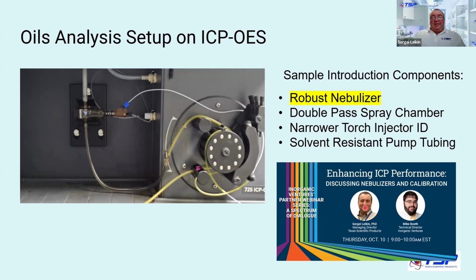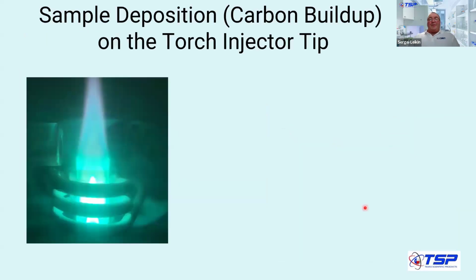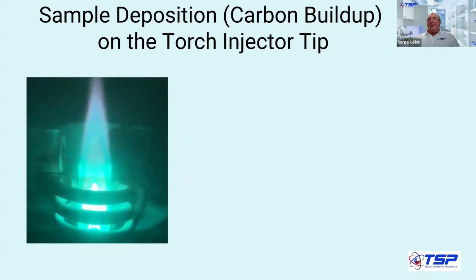So when you get this set up and then you start to run organics, what happens next? You will see here, the plasma is alive and everything looks good.